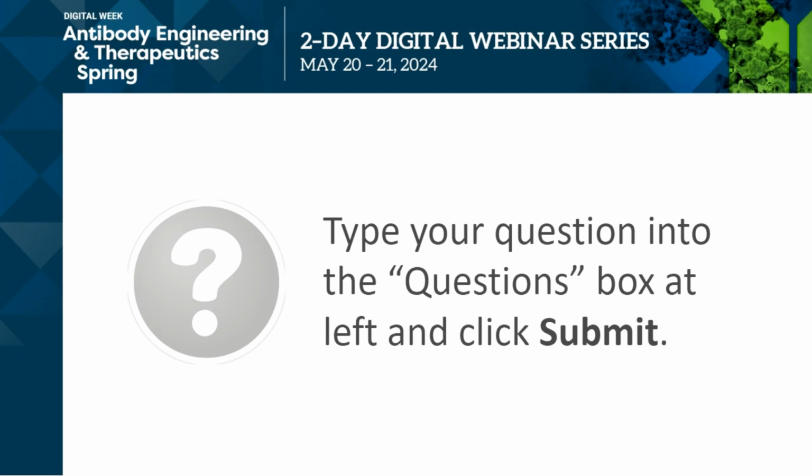Great, thank you. My next question from the audience: can you elaborate on the differences between ELISA and Gator? And what would be an example of positive ELISA data but negative Gator data?